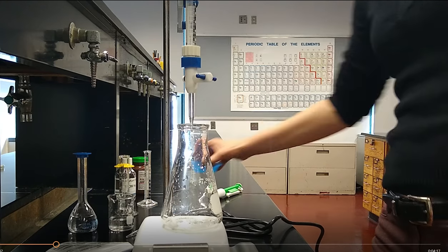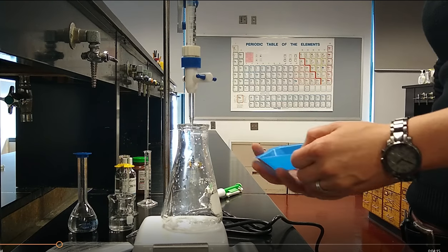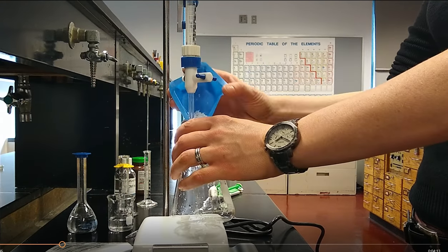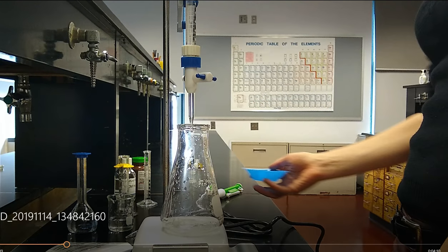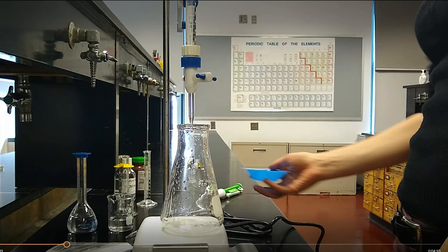The first thing we're going to put in is potassium iodide. KI is just a white solid. You need to measure out approximately one gram. It is not essential that KI is measured super carefully. Ballpark a gram, anywhere from 0.85 to 1.15 is totally adequate. We're not using the mass of potassium iodide for any calculations. It's simply providing I minus iodide ions for the reaction.